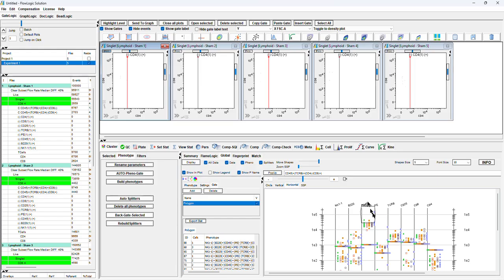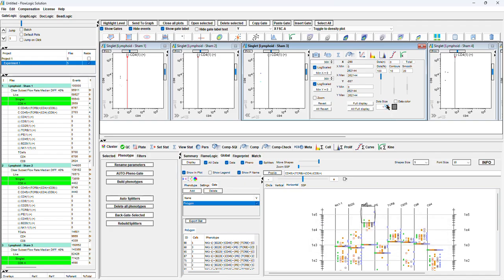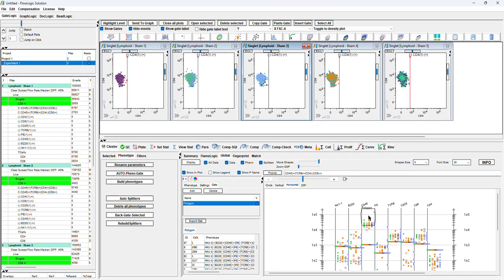And you can see it even for rare events. We can increase the dot, but here we have 2-3 events. We don't have many. You can see how the data gets extracted just for 2 files, and obviously you can see that it's just for 2 files.